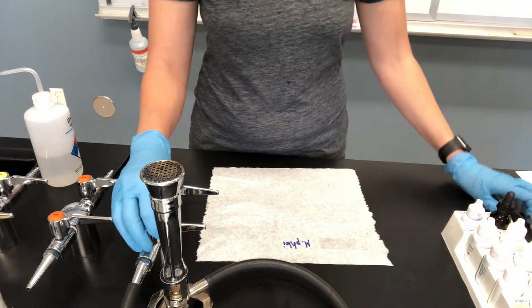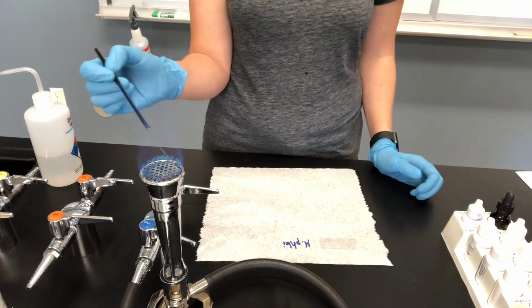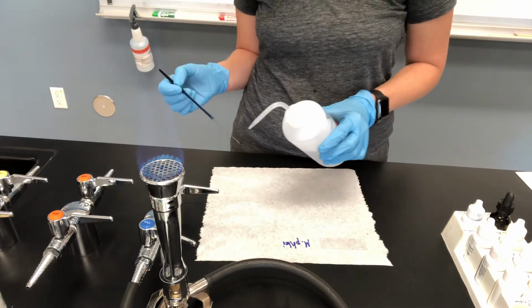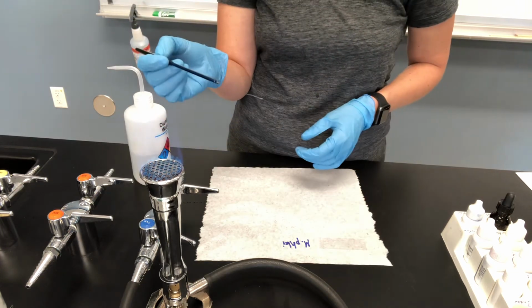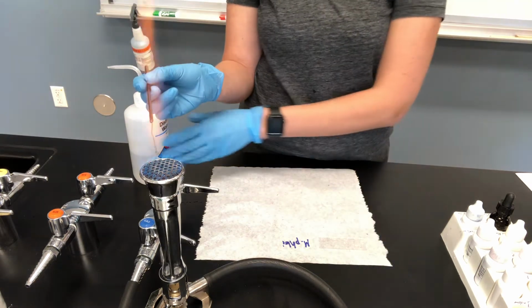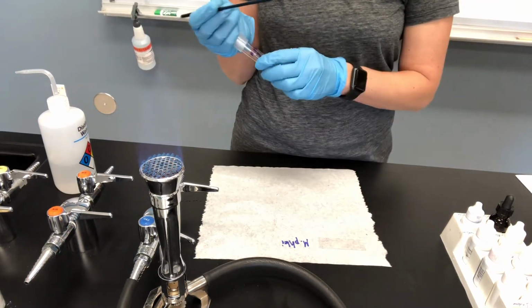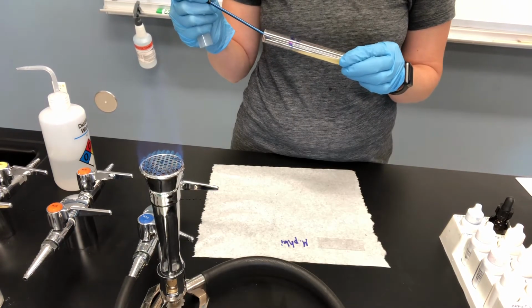All right, I'm going to start my flame, my loop. I'll get my drop of water, again using my loop as a nice little measuring tool to get the right amount of water for my smear. Just a little bit of water right there. I'm going to put that right in the middle. Flame my loop again. I'm going to try to get a little bit more bacteria this time, just because the smear didn't show up very well last time. So I'm going to try to make it a little more visible for you guys.